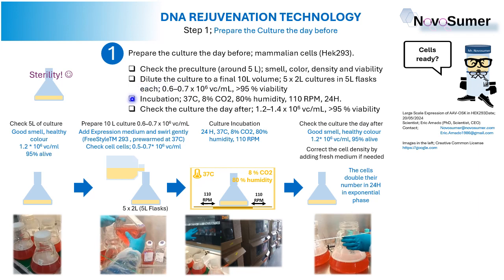And after the dilution, we will incubate the cells under these conditions. During the incubation that will last 24 hours, the cells will double their population again. So the day after, they will be double. The day after, as I have told you, we check the culture again. We want it to be healthy, okay? So let's go for the steps within this first step.